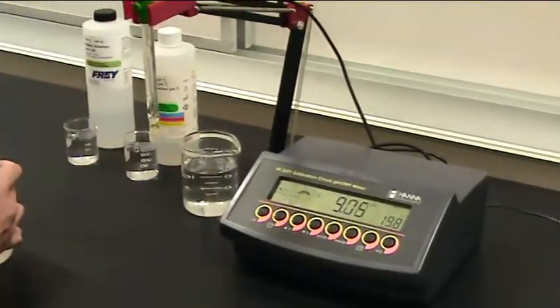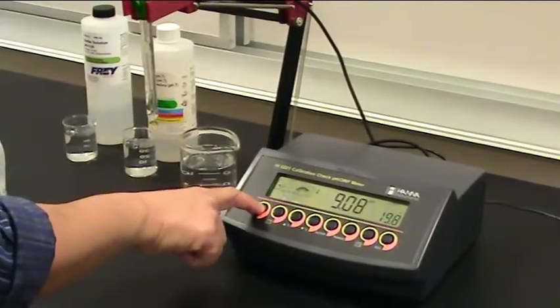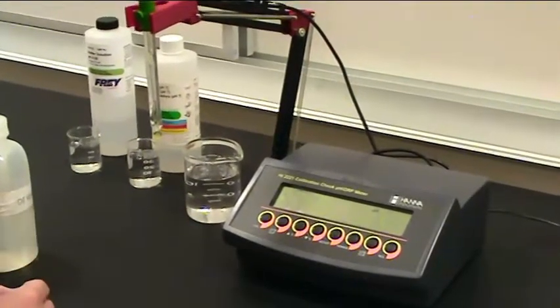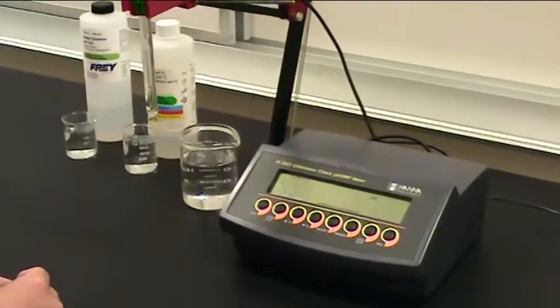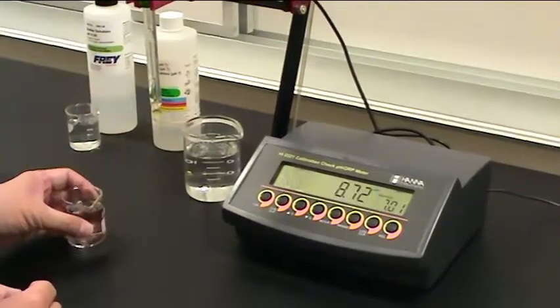And then we're going to begin by pushing the calibration button on the machine. After pushing calibration, you'll see the machine will blink for just a few moments, and then it will tell you which pH buffer you should use.